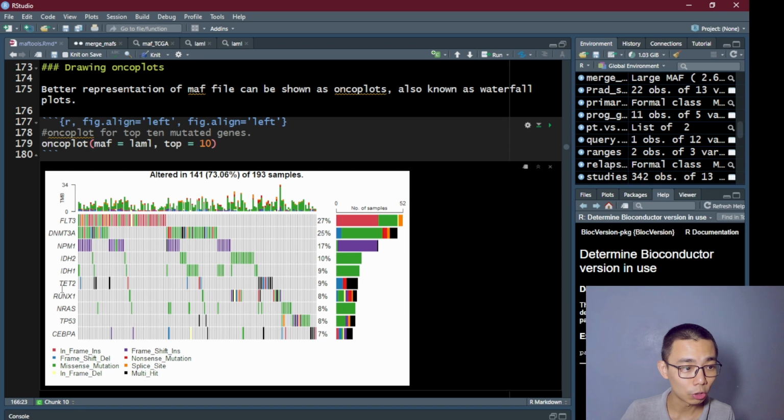However, for TP53, if I'm not wrong, when you have it, you also don't have other ones. Maybe it's DNMT3A. I actually have an analysis section down below. If you have this mutation here, you can see that it also affects some other mutation in the same sample, so there's some co-occurrence, and only the oncoplot will be able to show you that, on top of the bar chart up there.